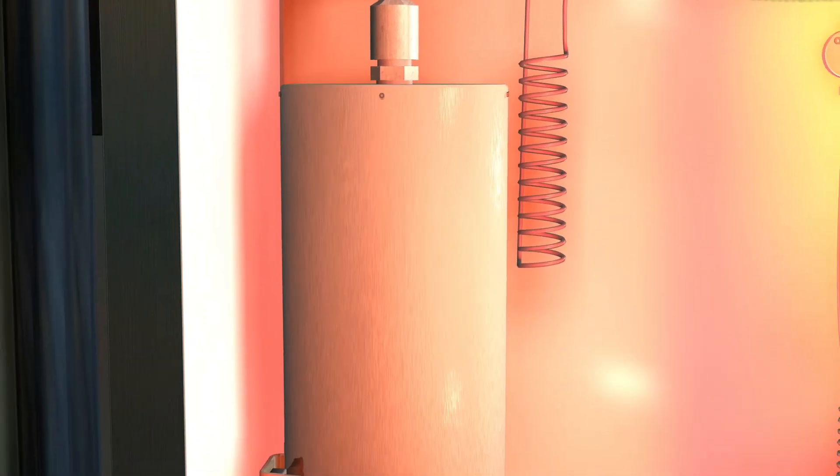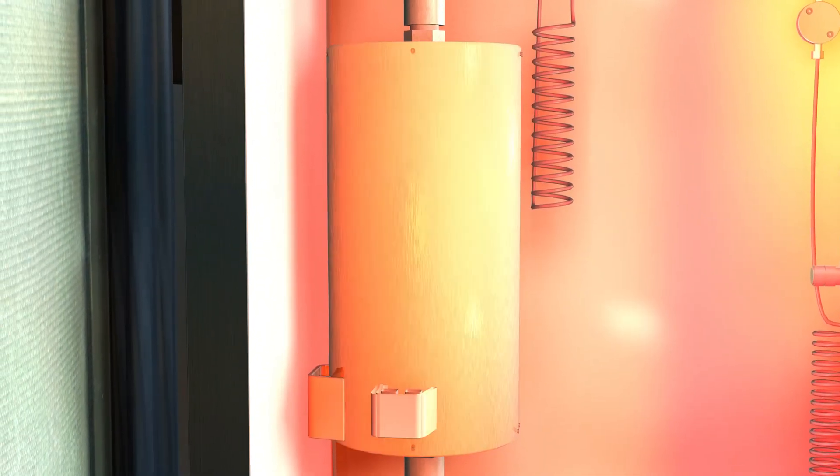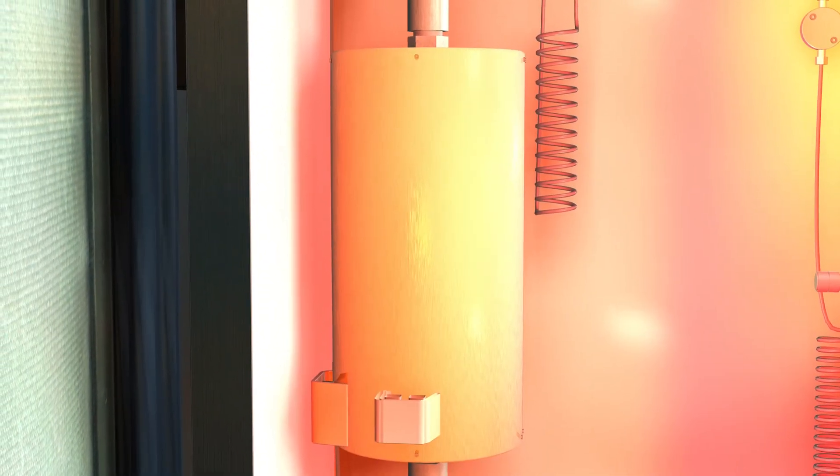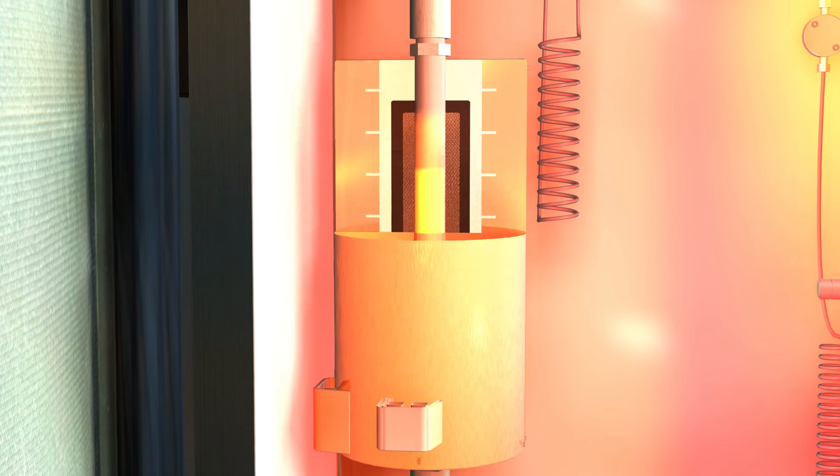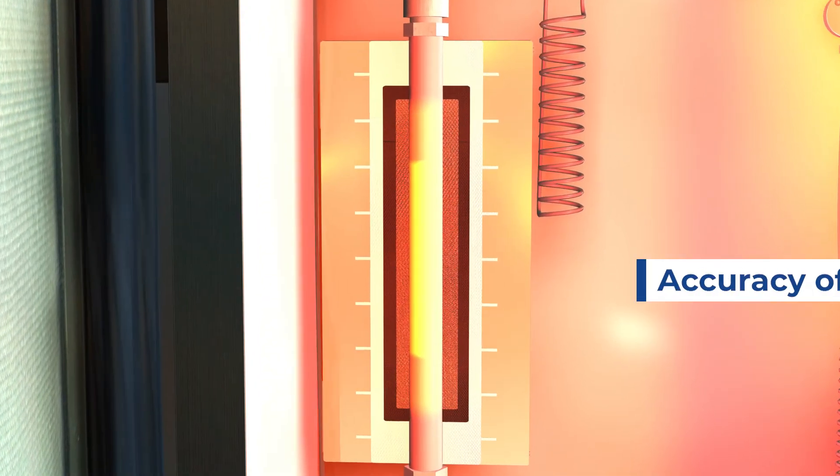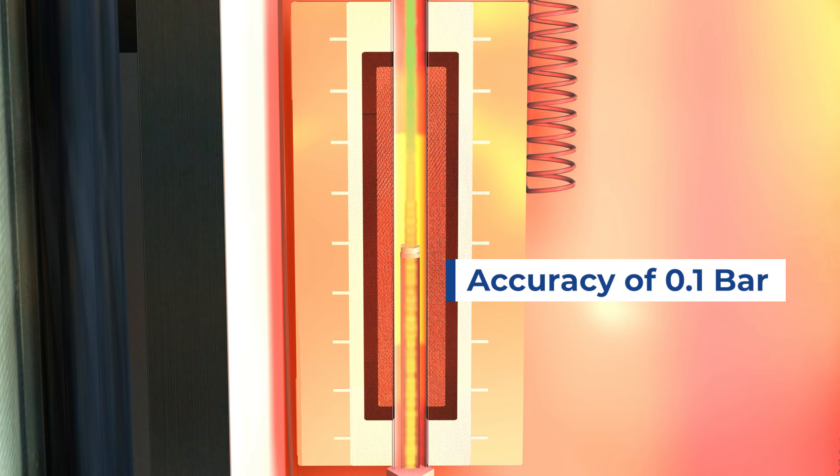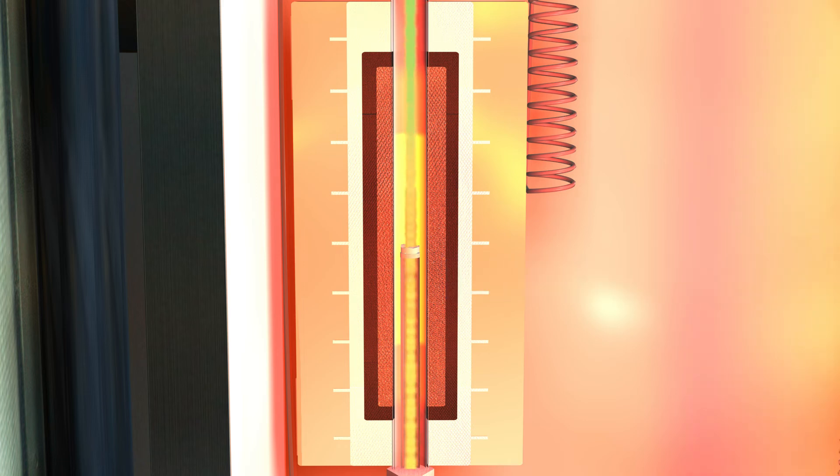The mixture flows into the reactor, which is loaded with catalyst, and it is heated up to reaction temperature. The reaction is catalyzed at the desired pressure, which is controlled with an accuracy of 0.1 bar, thanks to our patented pressure control system.